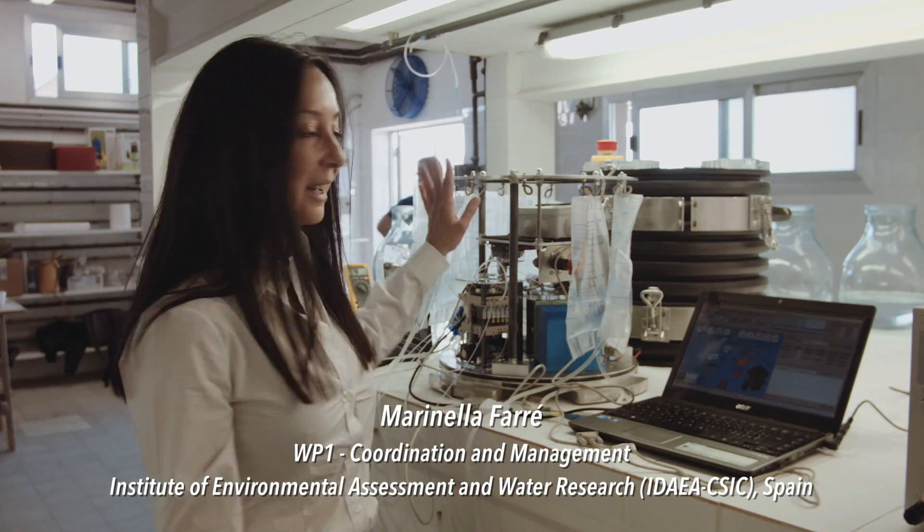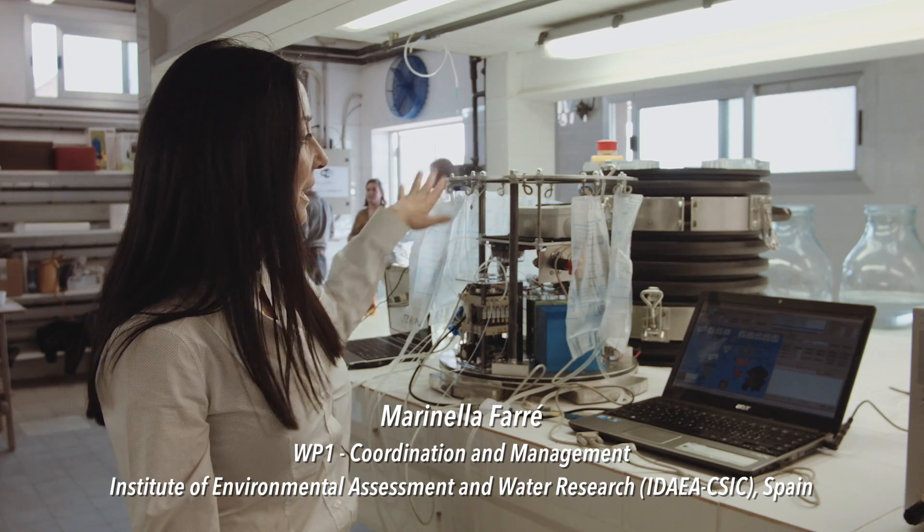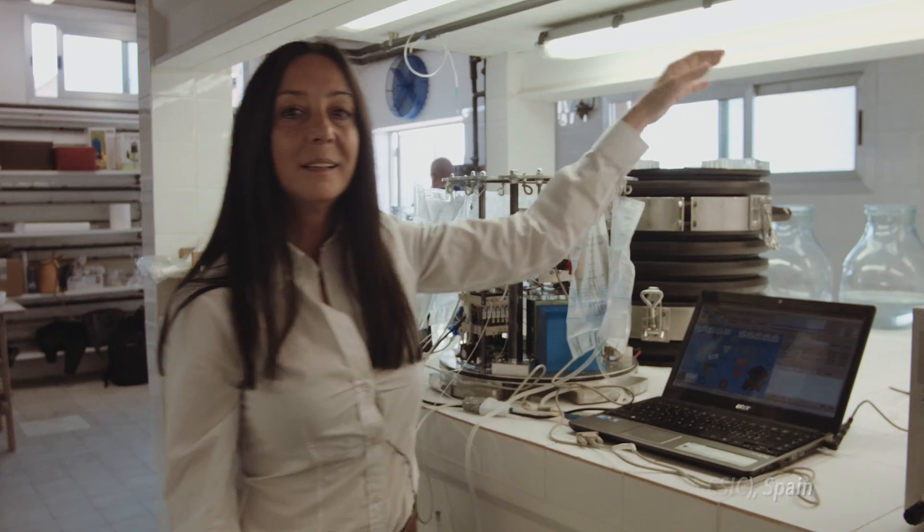My name is Marinella Farré, I am from the CSIC. This is the group that coordinates the project SEA-on-a-CHIP and this is the SEA-on-a-CHIP device. This is the inner part which is covered by this other part, and the system is a remote operational system to measure different contaminants in sea water.